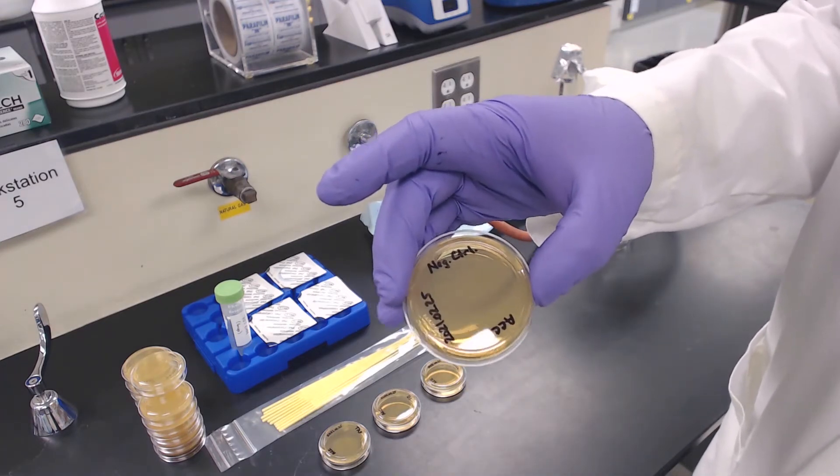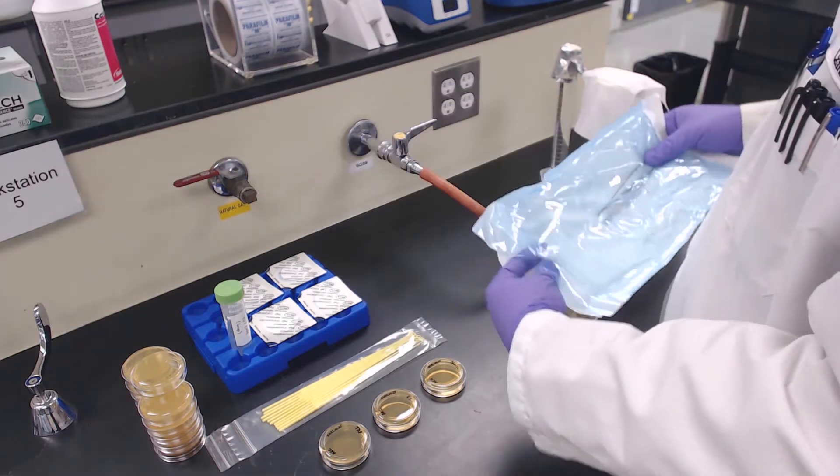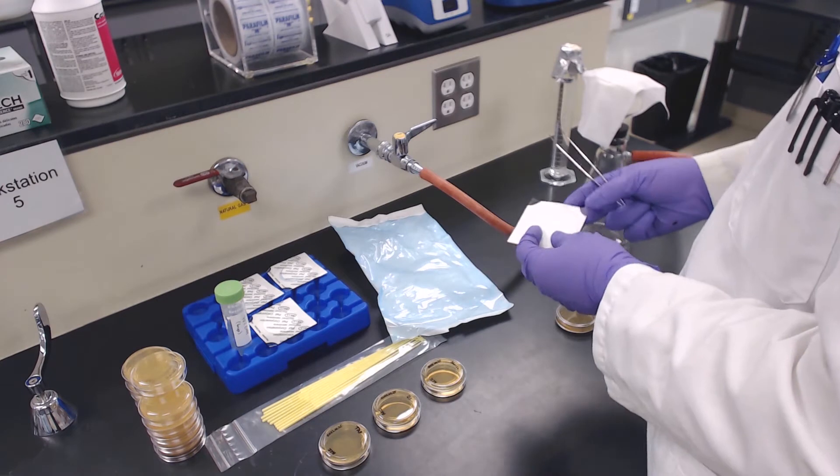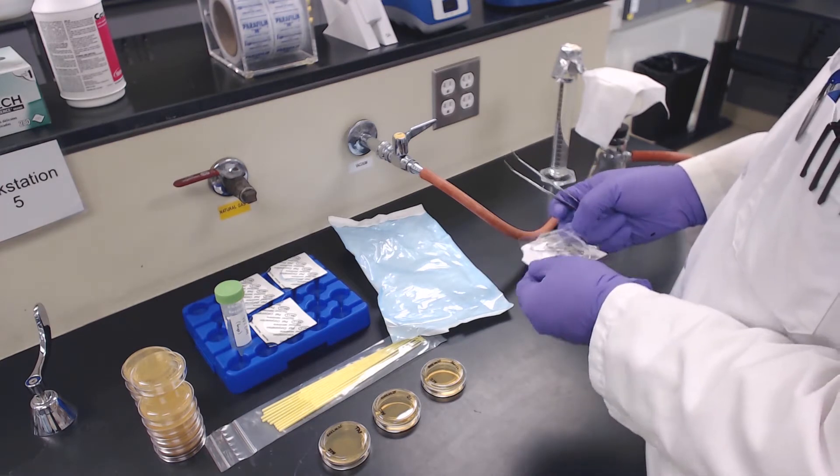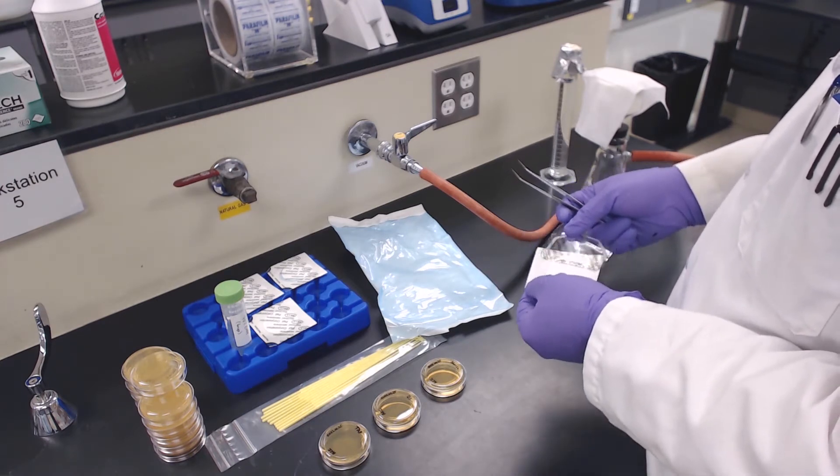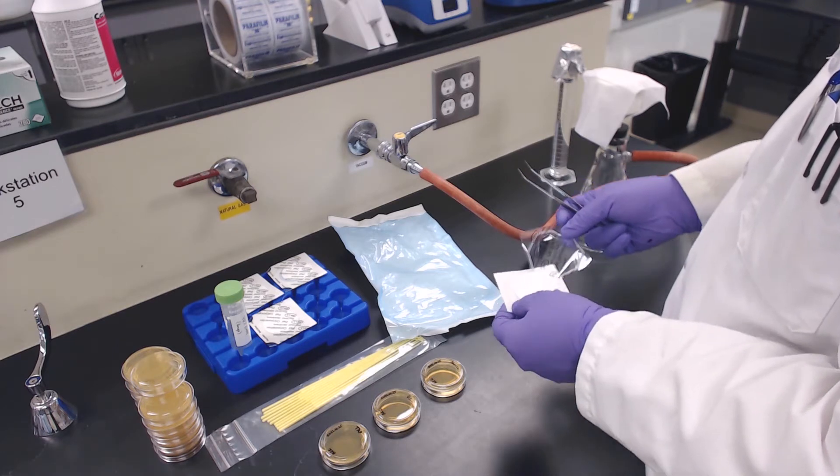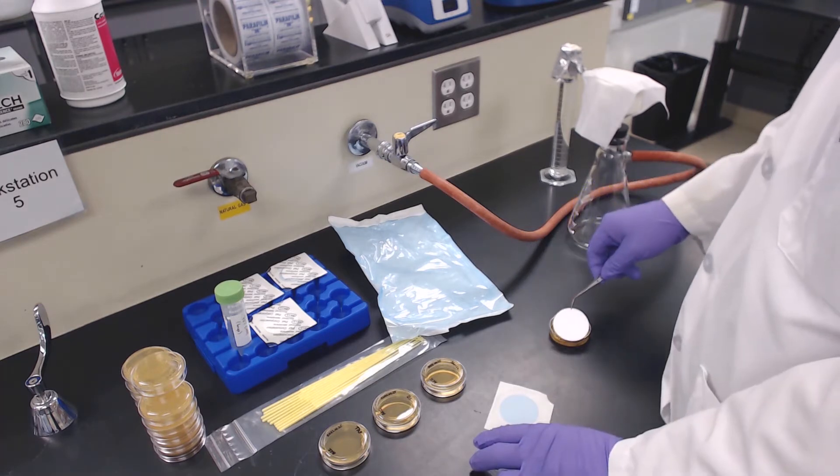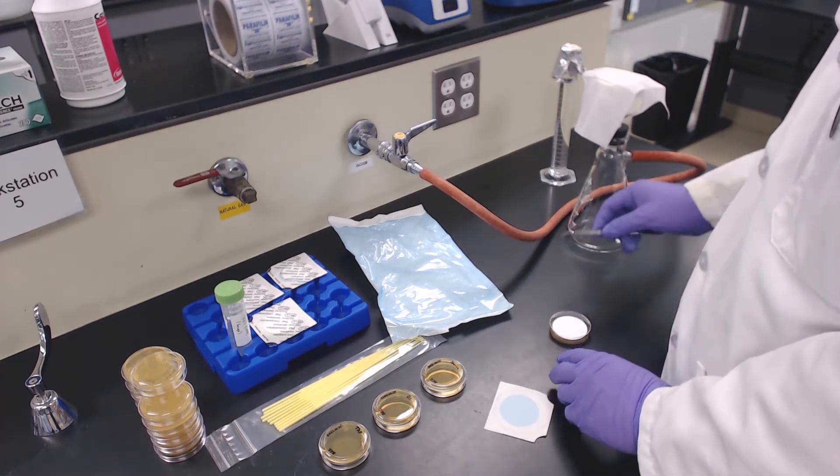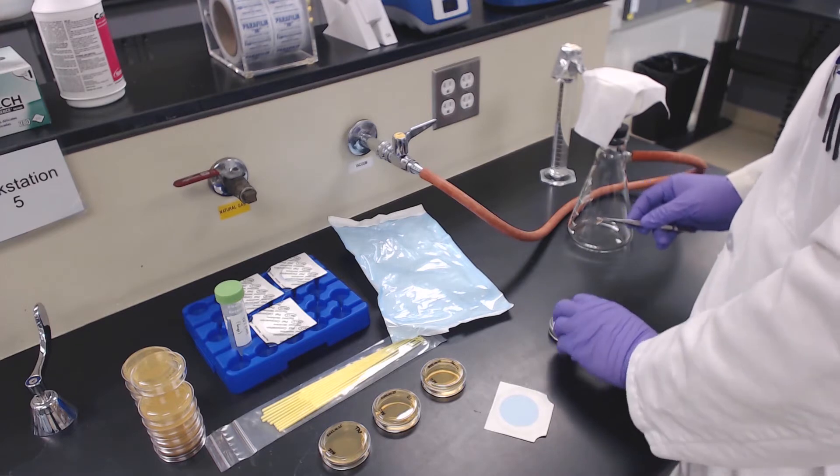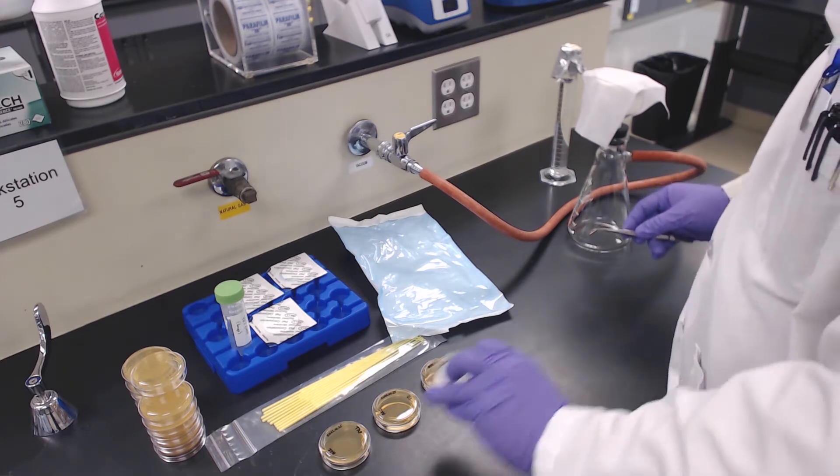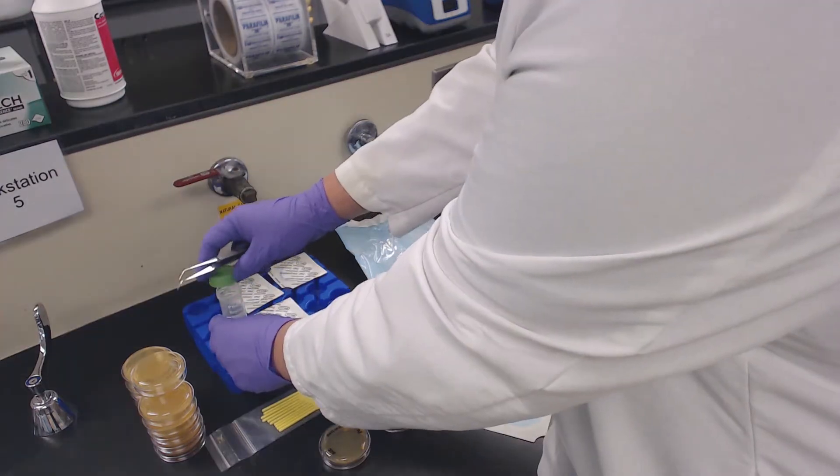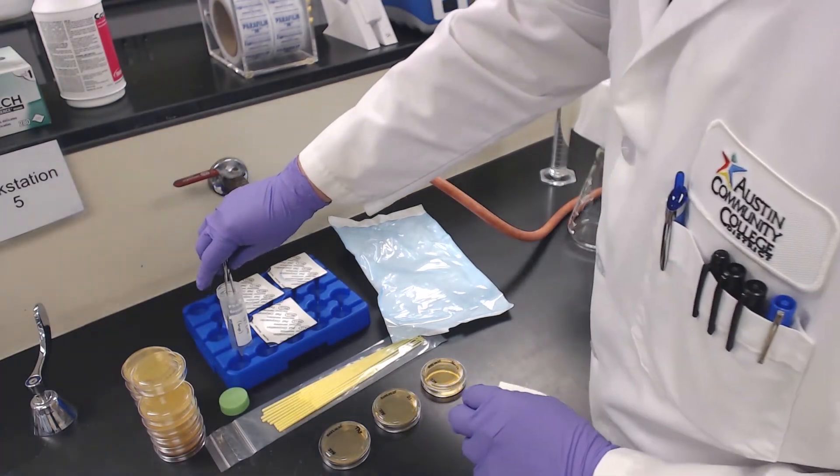Before filtering the water samples, prepare a negative control plate. Remove a gridded filter paper from the packaging. Using sterile forceps, place it directly on the negative control plate, grid side up. Set the plate aside so that you may process the other water samples. Place your forceps in the provided 70% ethanol to keep them sterile between use.